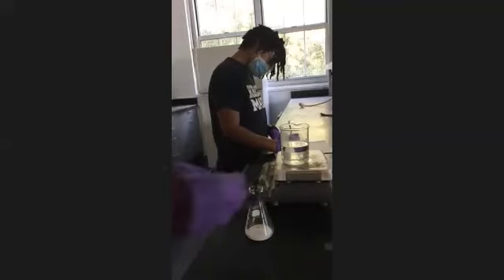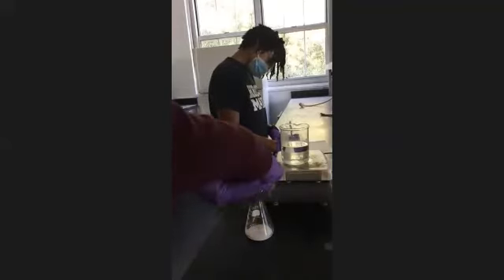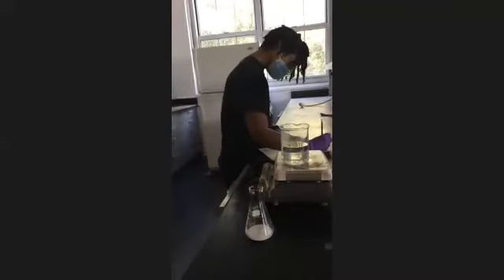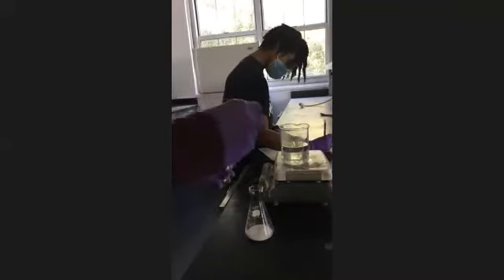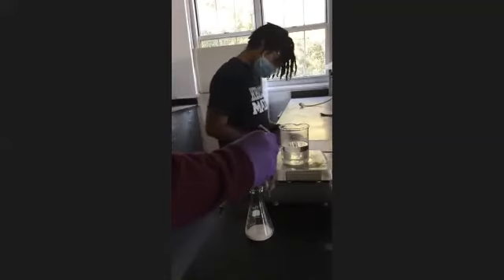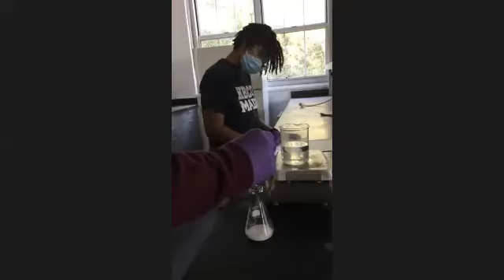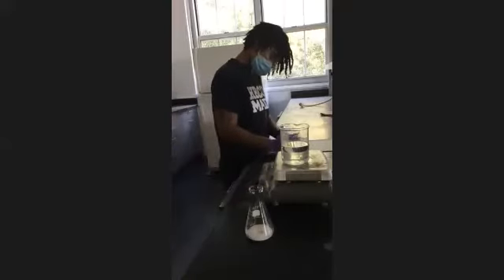All right. So that's 7 mils of acetic anhydride. Hopefully y'all can see me. And then I'm going to add in 6 drops of sulfuric acid. All right. So that's six drops of sulfuric acid.